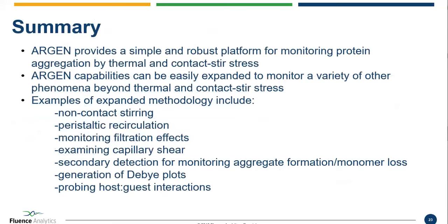In regard to slide 13, Kurt, have you ever seen filtration promote aggregates? Also, have you tested different filters with different materials?